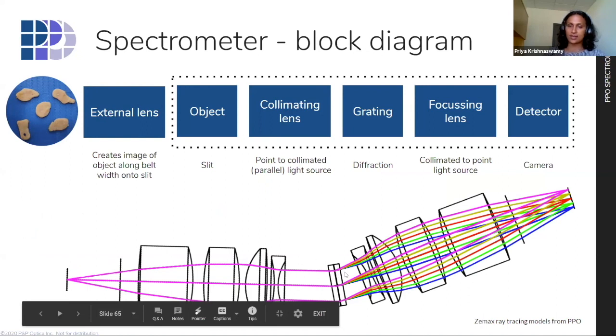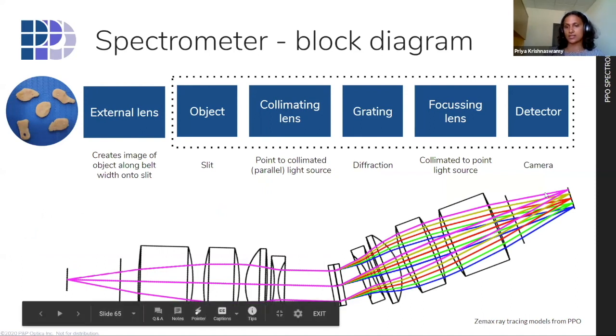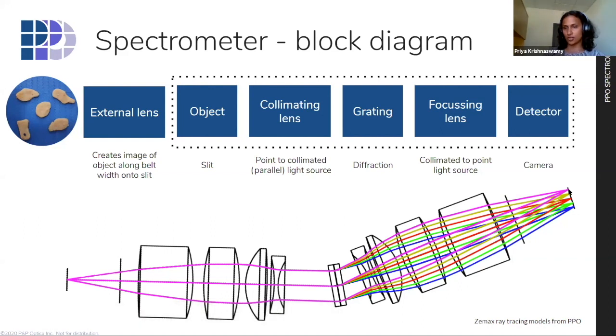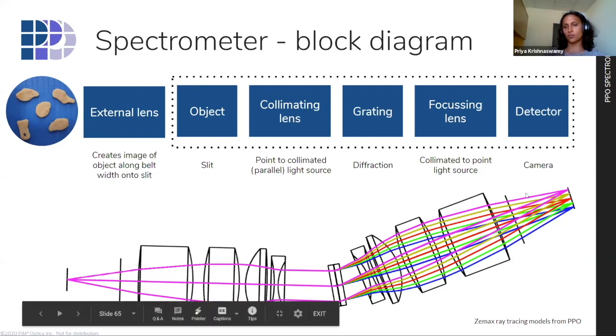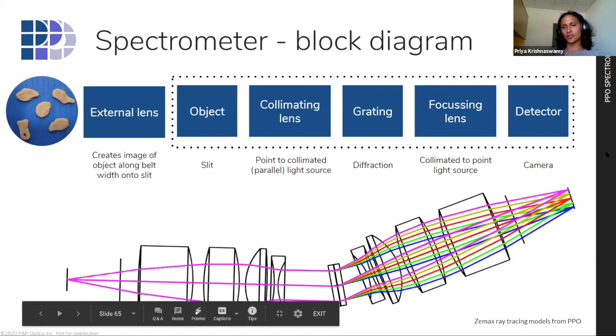You can see that there are close to 5 colors, and every color represents a different wavelength. All the pink comes to one focal position, so all of one wavelength comes to a focus, and now you have all the wavelengths in focus, and you have enough information from one point to all its constituent wavelengths.